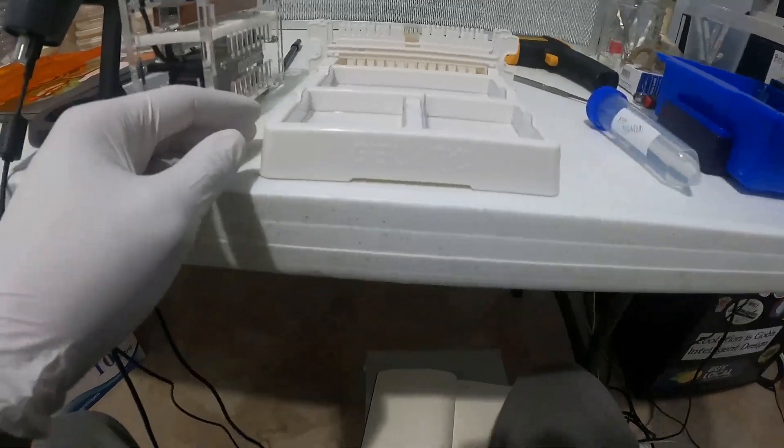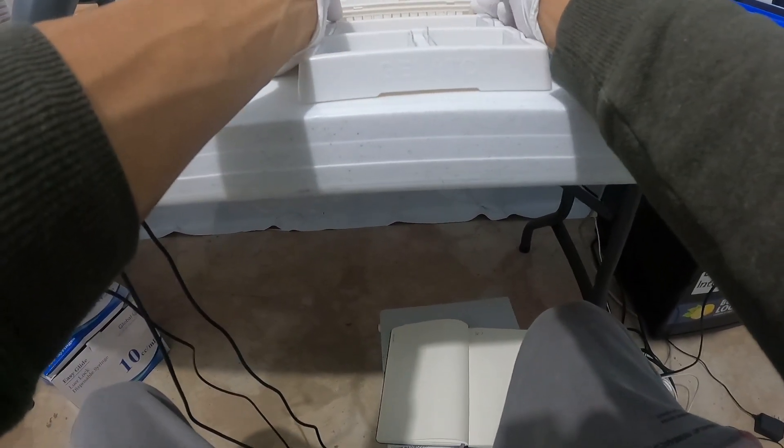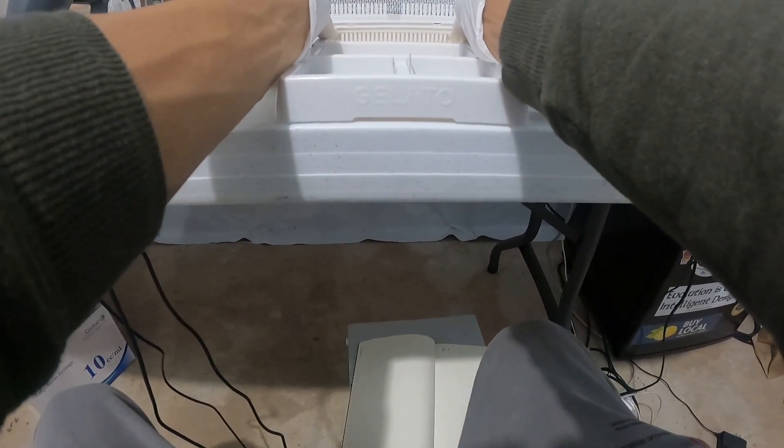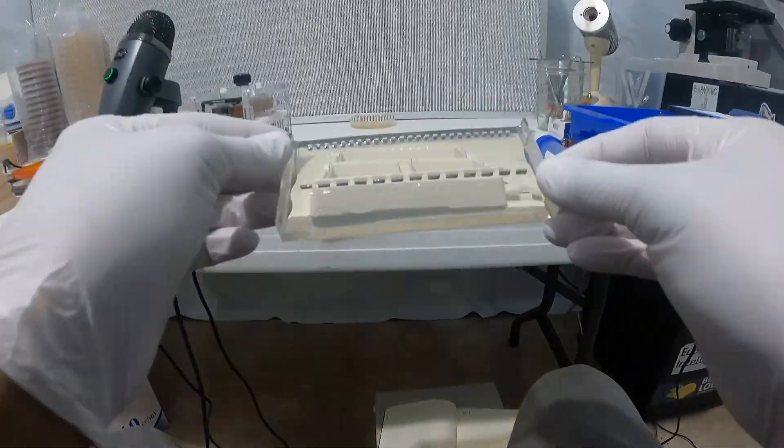Now that the gel is hardened, I sit down to pull the combs out of the tray. You kind of want to just gently slide the comb out of the gel, and then you have your wells that you can put your DNA into.